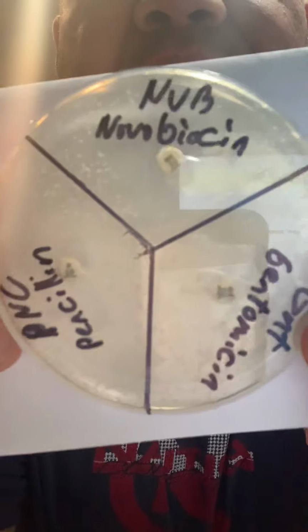After 24 hours of incubation, there shows a growth of the microbes, and the antibiotics have had an effect. This is the result of my experiment.